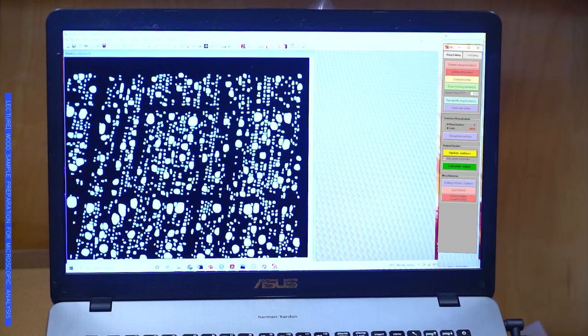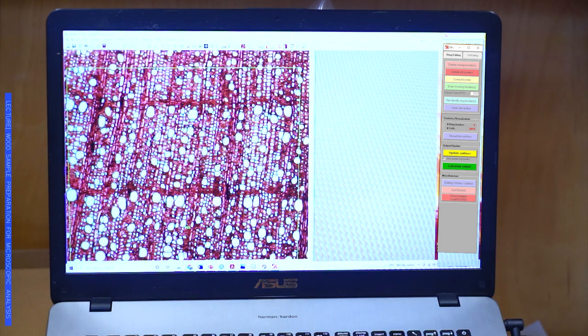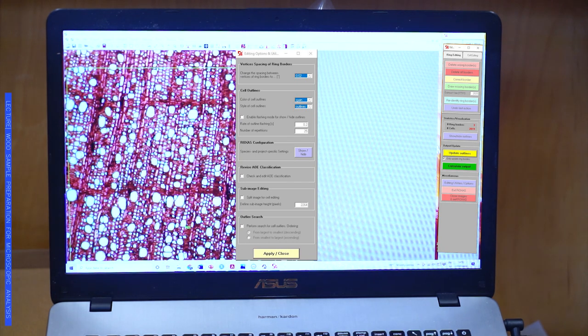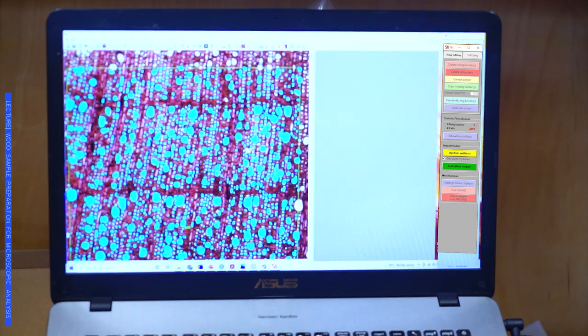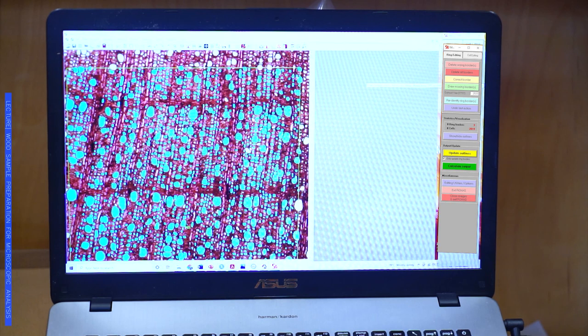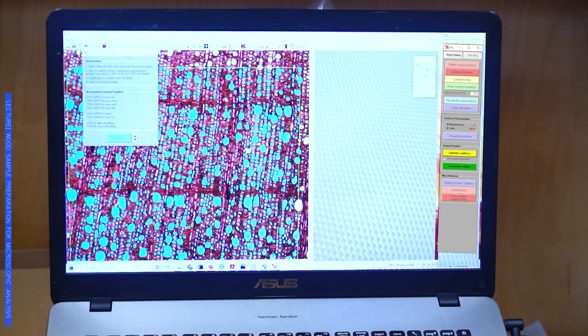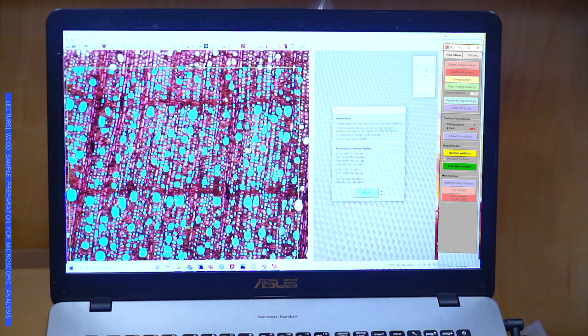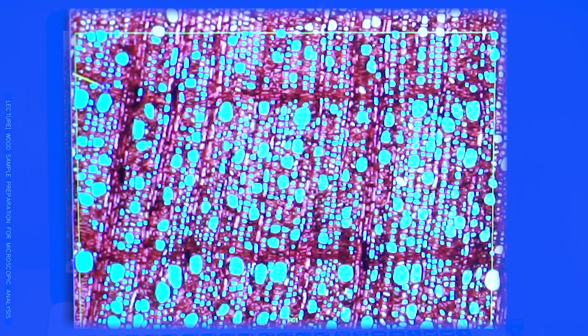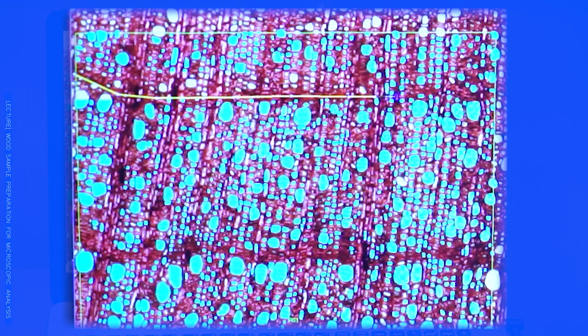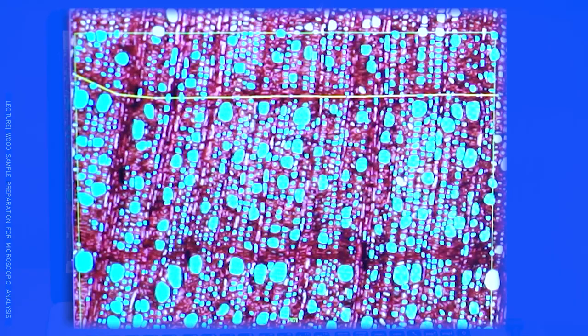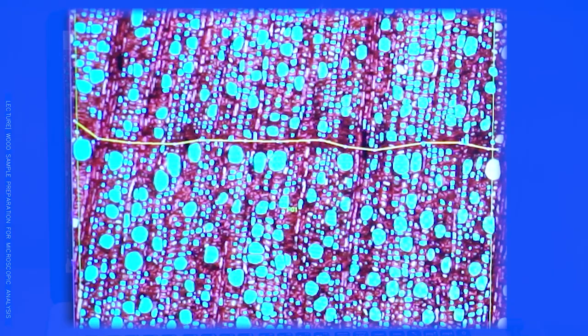I can change this here into the image with the real image. Here we can see the results. Normally, automatically we can design the rings. In this case, I will just do it manually because it's a very small image. We normally visually can tell where the ring is positioned. It's just a matter of giving these parameters. Because then the program will calculate all the data for these cells and will position them on the years that we will tell the program.